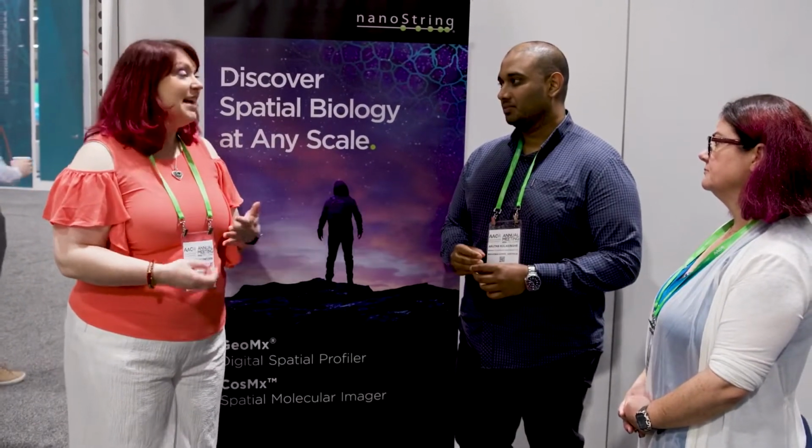Yeah, exactly. I also wanted to mention, you touched on this in your talk, that tissues, not blood, is where immune cells function, right? So it's great to look at blood samples and PBMCs, but really where the functionality happens and where the immune cells are fighting disease really occurs in the tissue. Yeah. So, people for decades have been looking at imaging, but with high-plex spatial profiling with GeoMx and CosMx, we can really look at many more markers than we were ever able to before.